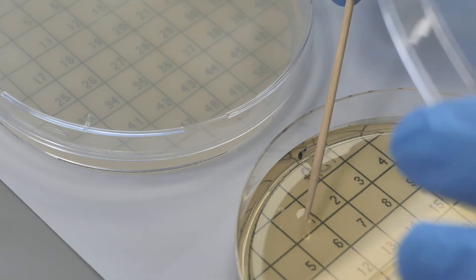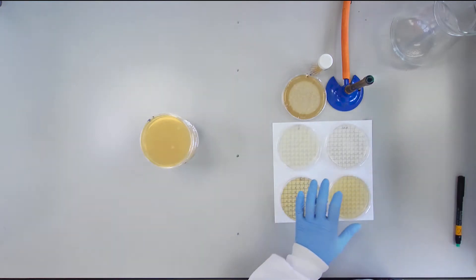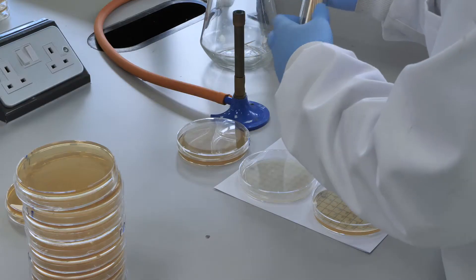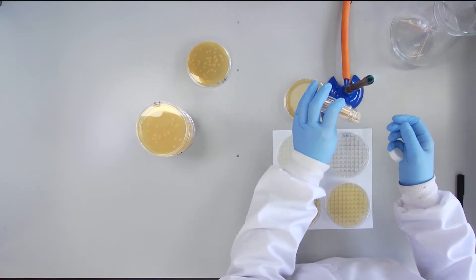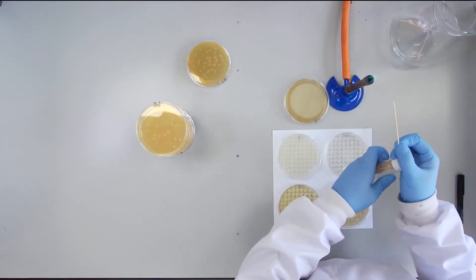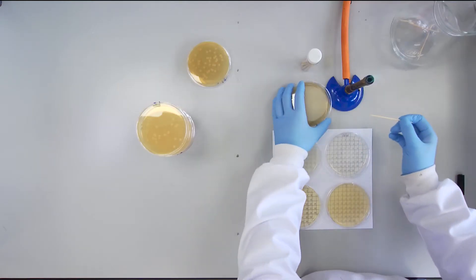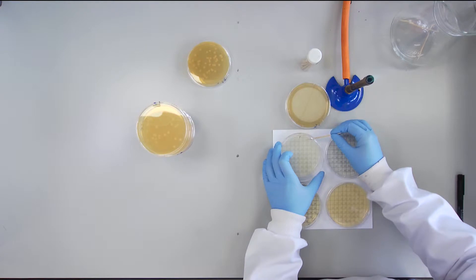Paying attention to aseptic technique is critical. Repeat this process for nine more colonies, leaving space on the plate between the squares used.